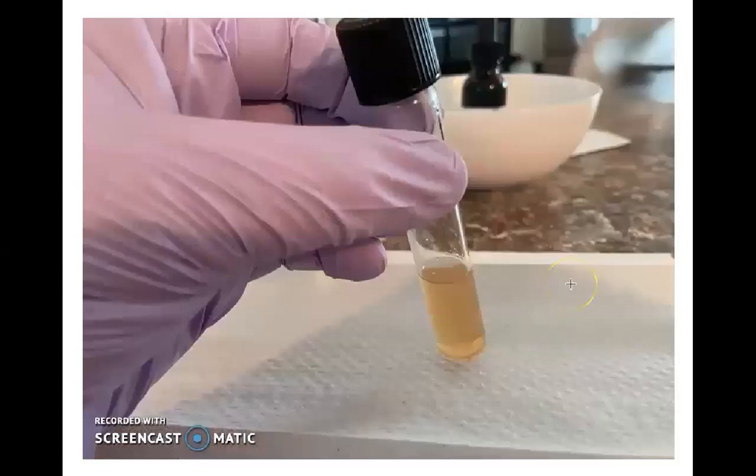Now, in this test tube, I'm holding a nutrient broth culture. It has bacteria growing in it, so I would have just pulled this out of the incubator, and I'm now ready to examine cells that are inside the culture.